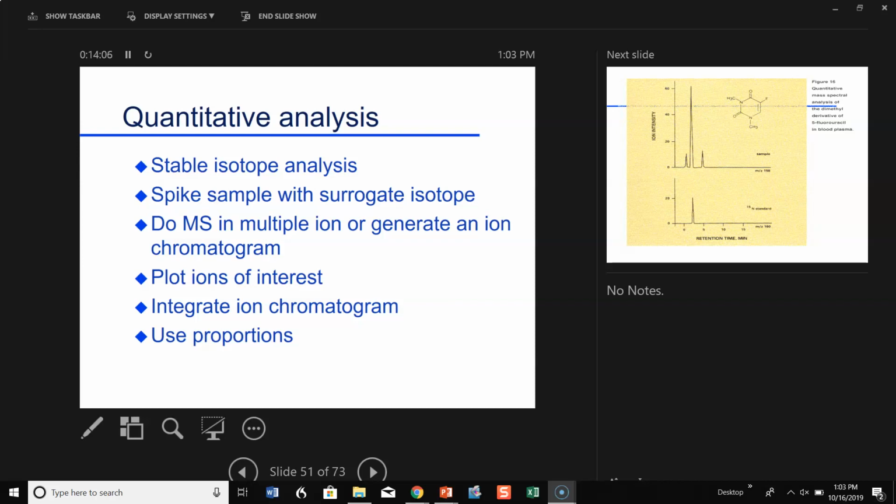But we think about how we can use mass spectrometry to measure quantity. I talked about identifying components. We use it to identify unknowns. We can also use it to measure the quantity of unknowns. And so one of the best ways to do this, certainly in my field too, if I want to know how much of some odorant is present in a sample, this is an expensive way to do it. It cost me about $10,000 for my sample, my reference, my control. So, okay, I pay my 10 grand. I got a couple micrograms of material.